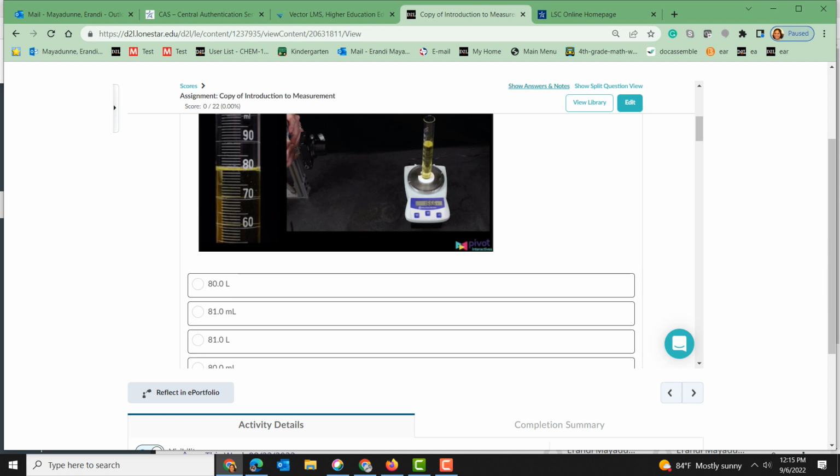Whenever you are finding the volume, you should go for the meniscus. Meniscus means the bottom of the curvature. If I draw it here, you don't read it here. That's wrong. You read it at the bottom of the meniscus. So that's the reading place. When you pick the reading, it's the same thing enlarged over here, and then you select your answer.